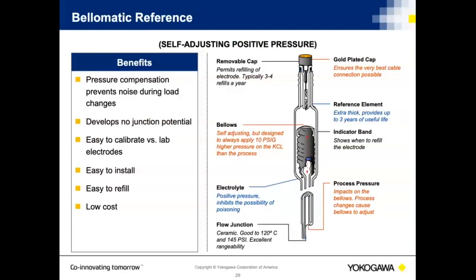So process ions basically move and exchange between that silver chloride electrode through the potassium chloride. The whole purpose of the potassium chloride in the high purity application is to make contact with the measuring electrode. Without the exchange of potassium chloride, because there's very few ions present in solution in a high purity application, you must introduce potassium chloride to make the connection.